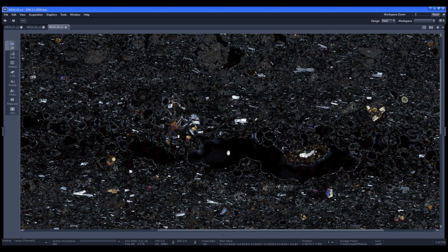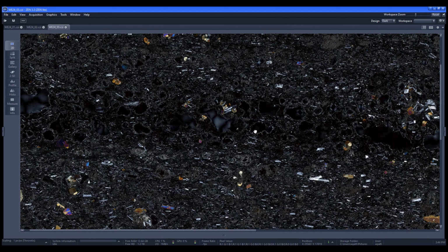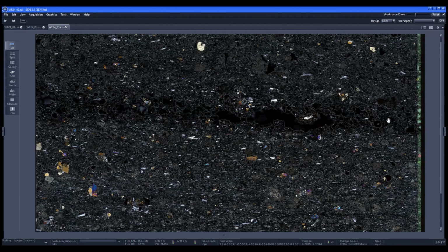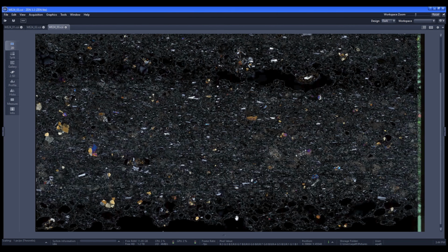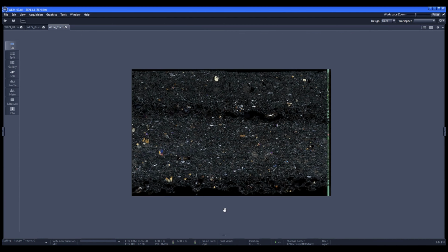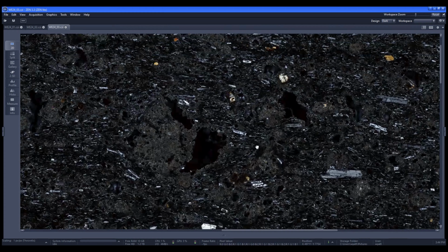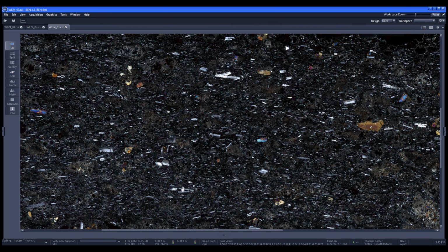The gas was trying to escape from this molten mush, and it was likely expanding. And it looks like it was expanding right along this line here, because there's a lot of these vesicular bubbles forming in this little line right here. So this is likely near the crust area of the volcanic bomb. And then, of course, down here, there was a lot as well. And there's some other smaller ones that kind of are spread out throughout the bomb. Something else you might notice is the plagioclase waves. So plagioclase is really good at showing flow direction.